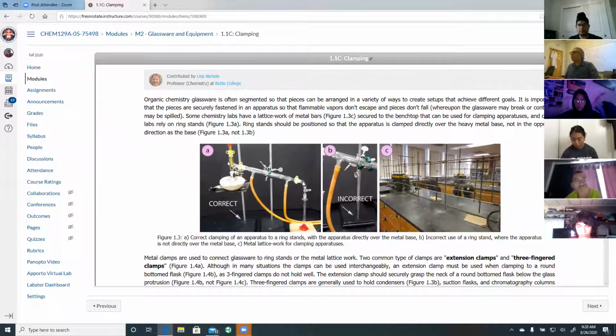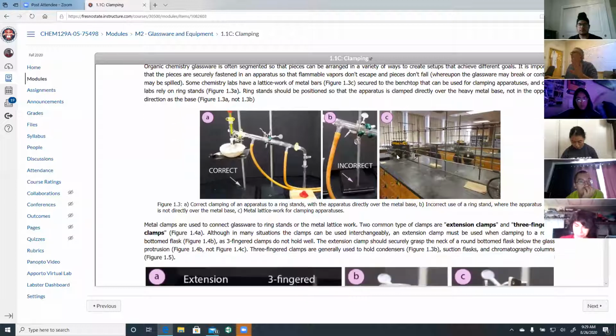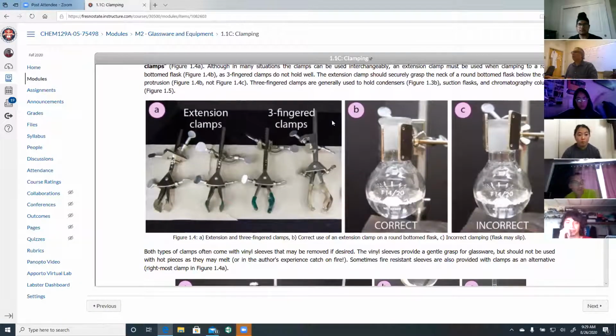This is a bent adapter. At the end, again, there is a clamp so that they don't get disconnected. And you are collecting the distillate in a graduated cylinder so that you can measure, like, half a mil was collected at such and such time, 1 mil was collected at such and such time, and you can actually draw a graph by plotting the volume of distillate that comes out against the temperature. You will actually be doing it. So this picture is very important. If something is incorrect, you can look at it later on. These are different. Question. Yes.